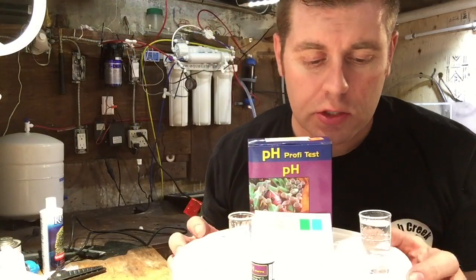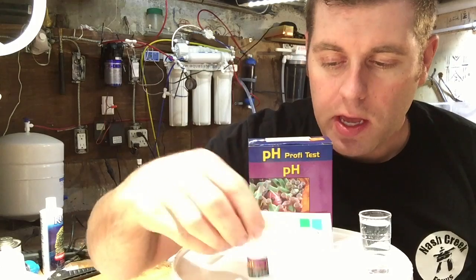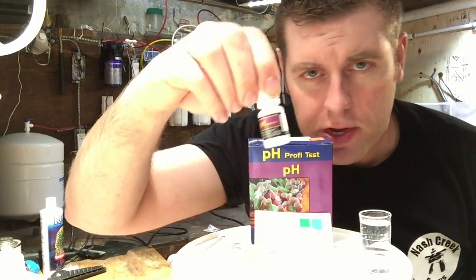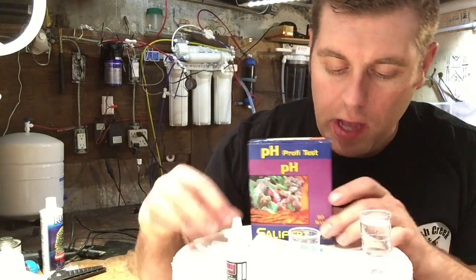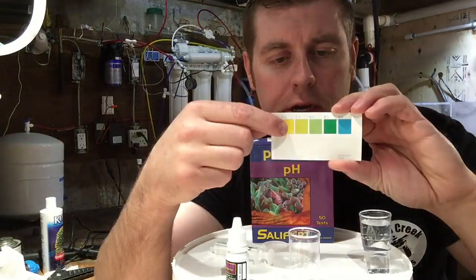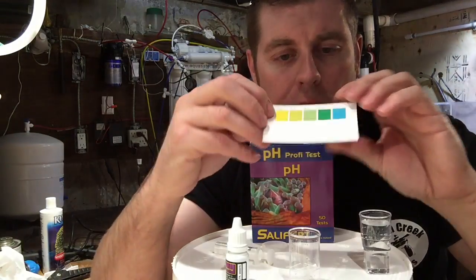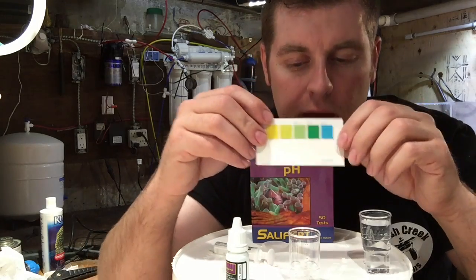I got everything unpacked here. So it comes with a little vial to put your aquarium water in. It comes with the solution — the pH marine — that comes in your box. And it comes with a 5 milliliter syringe. And it comes with a chart that shows you what to compare after you do your test. We're looking for the ideal 8.0, which is a green color.